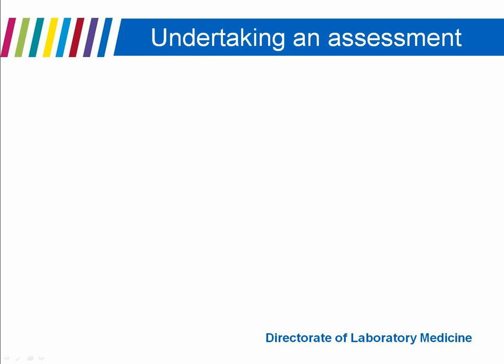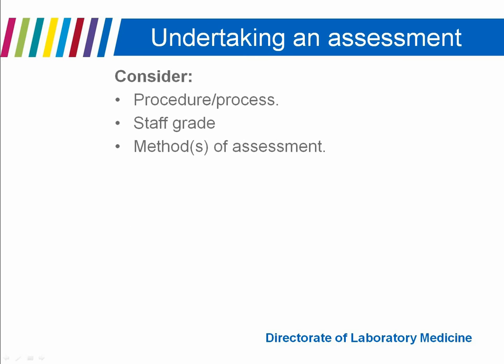So, designing and undertaking assessment, consider the procedure and the complexity of it. What does it involve? The staff grade that carries out that procedure, what do they do, or what you expect them to do, and what methods of assessment you're going to use.